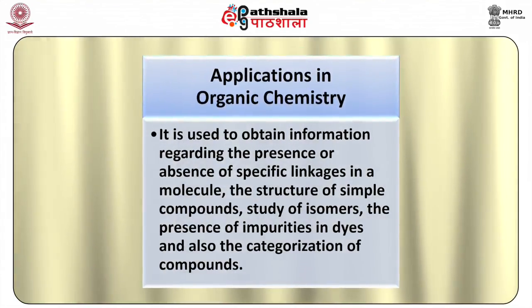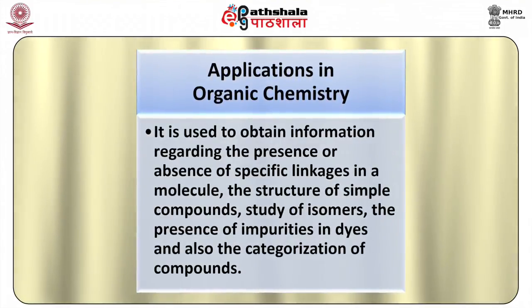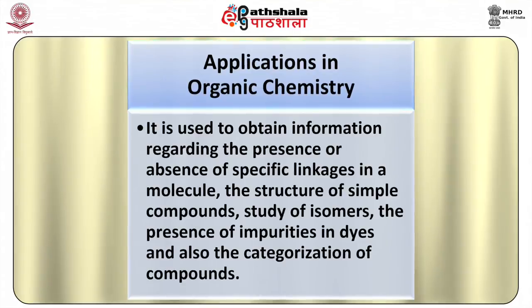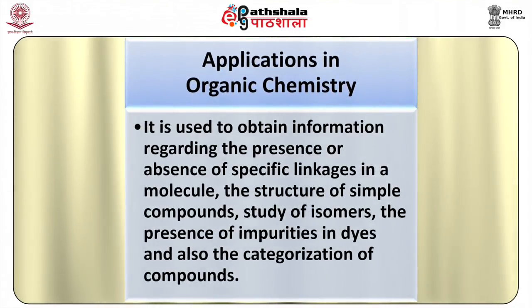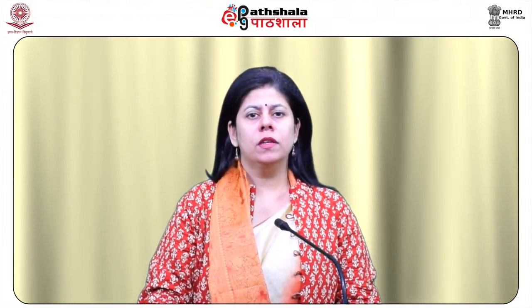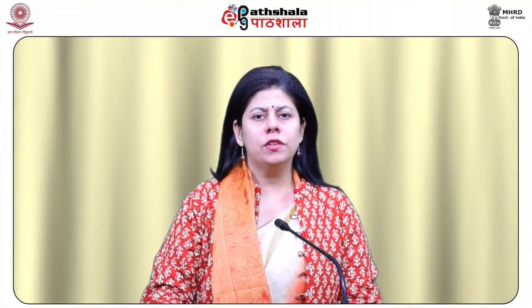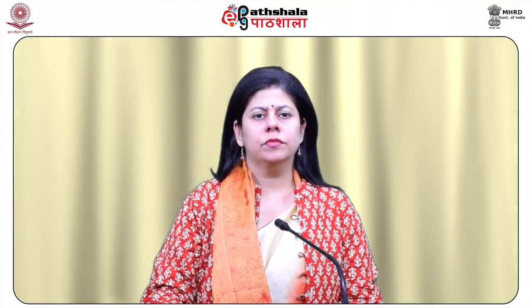Application in organic chemistry. It is used to obtain information regarding the presence or absence of specific linkages in a molecule, the structure of simple compounds, study of isomers, the presence of impurities in dyes, and also the categorization of compounds. Application in polymer chemistry. Raman spectroscopy is used for characterization of polymer compounds by revealing the physical properties such as how the molecules are arranged, polymer crystallinity, tacticity and amorphous character.